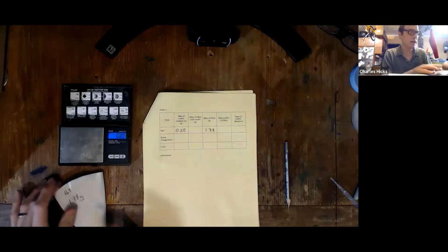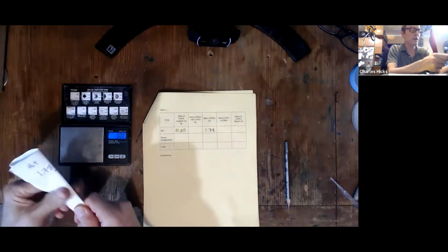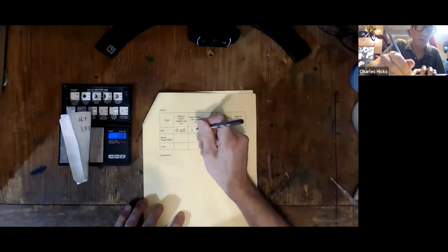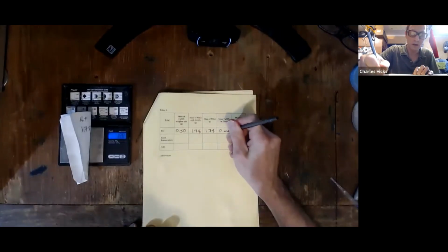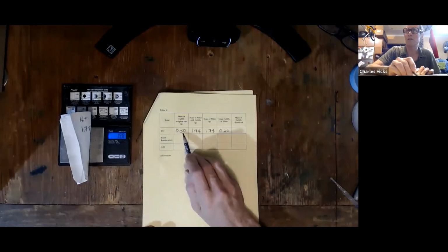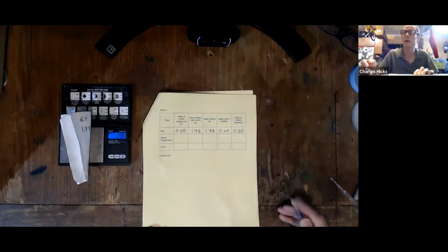So now a week has passed. I've had this on my window near the radiator. So now I'm going to weigh it to find out how much calcium sulfate is trapped in the filter. Okay. And that would be the mass here, 1.98 grams. So the mass of calcium sulfate in the filter is just the difference between these two. Looks like 0.20. And that means since there was 0.50 grams I started off with, if 0.2 of it ended up in the filter, the mass that ended up dissolving would be the difference between those two, 0.30.